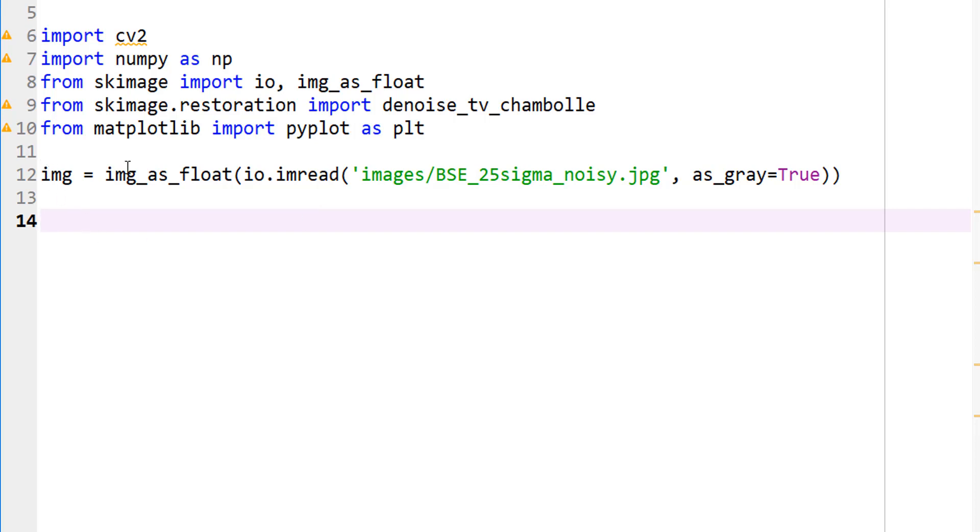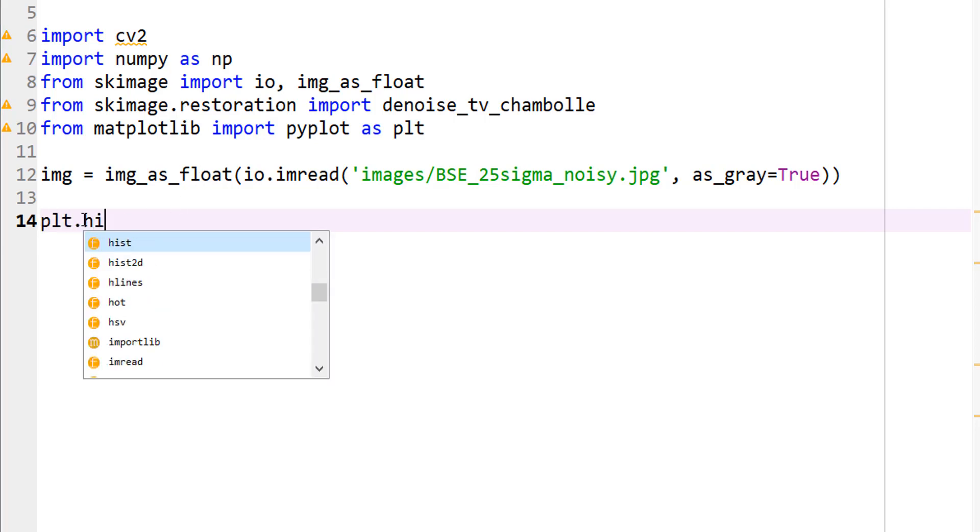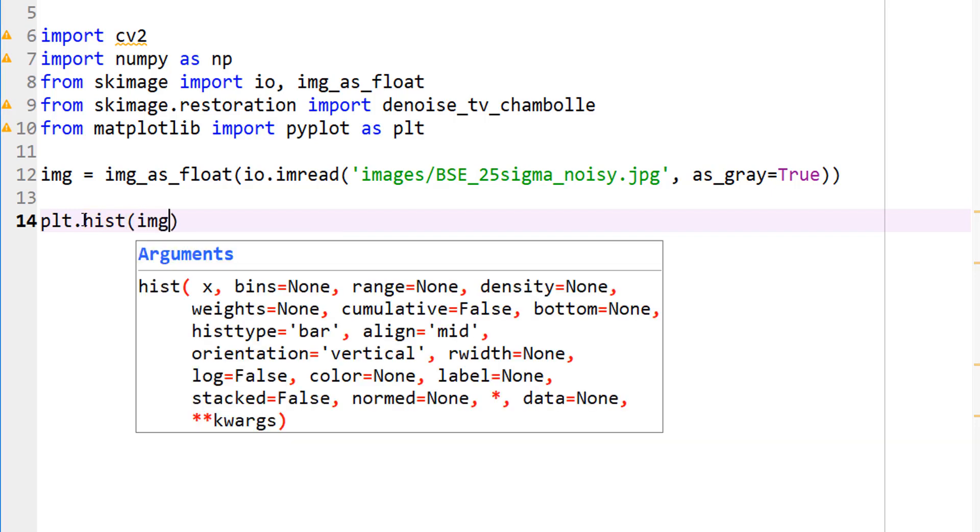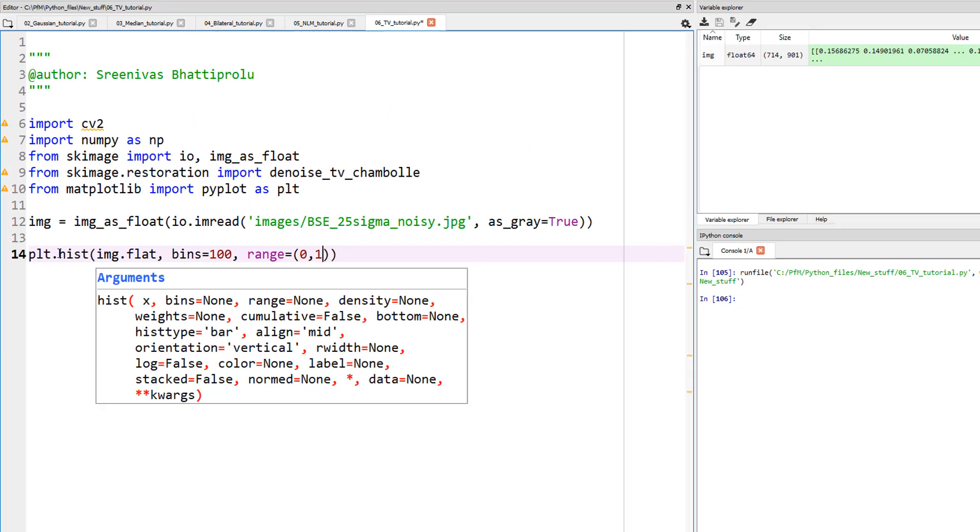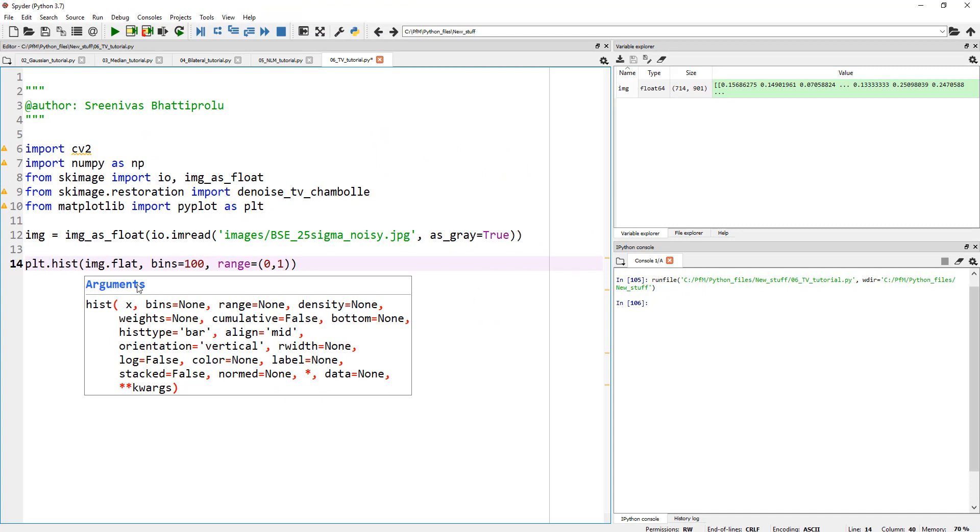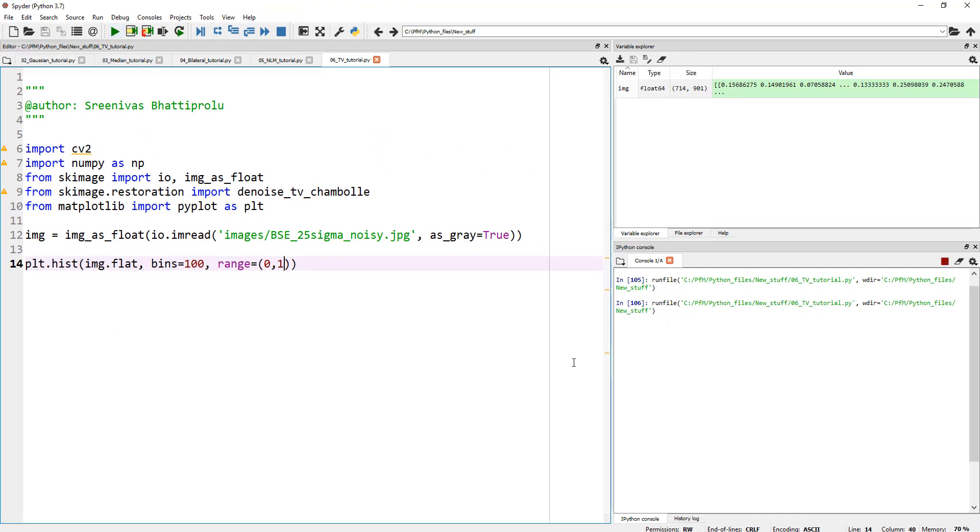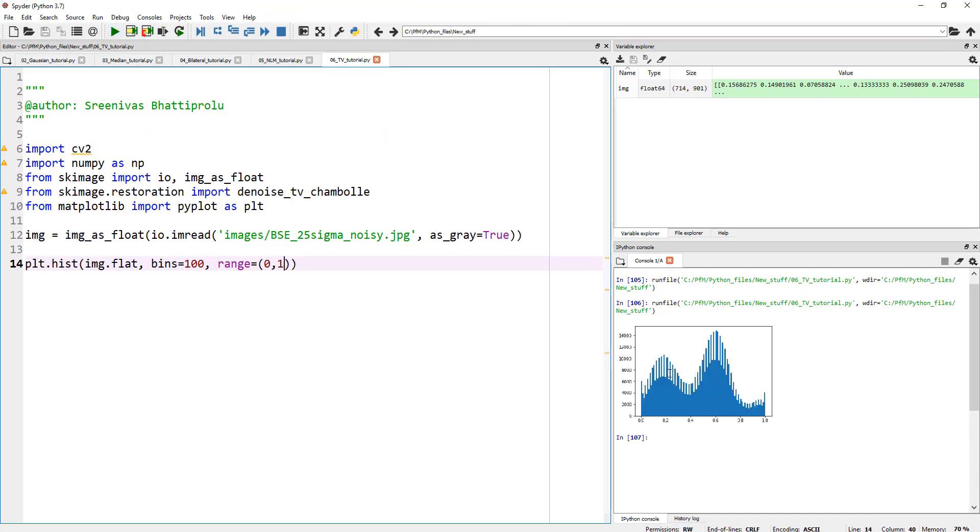So far, so good, and let's actually run this until this point, and everything looks fine. So now my image is imported as a floating point, and let's actually plot the histogram. And I hope you know how to do that. So first let's flatten out our image array, which means it becomes one dimension. Let's actually plot 100 bins, and our range equals to, can you guess? 0 to 1, because this is a floating-point image. Let's go ahead and plot it, and we should see our image.